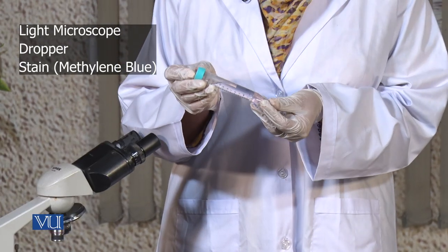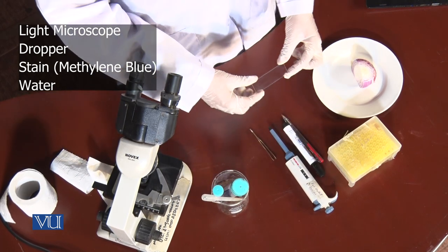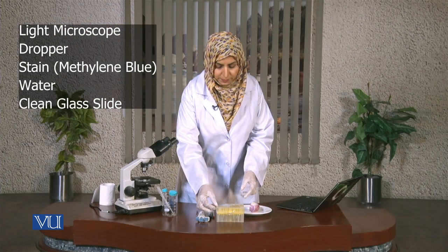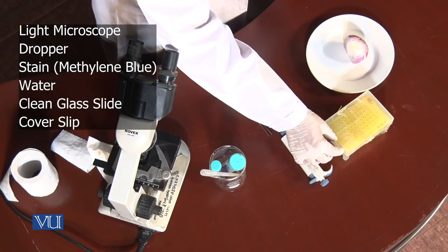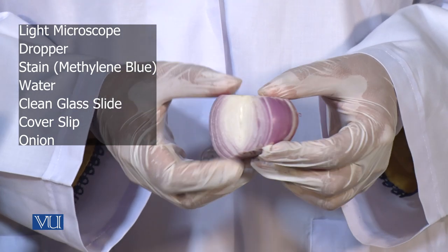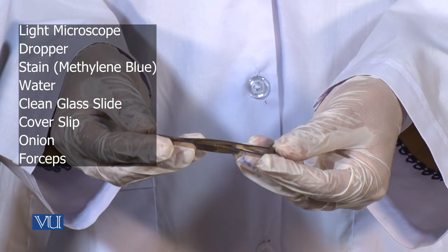We are also going to need water, a clean glass slide, and a cover slip which is square in shape. We are also going to need the onion — I have cut it into half — and we'll also need the tweezers or forceps.